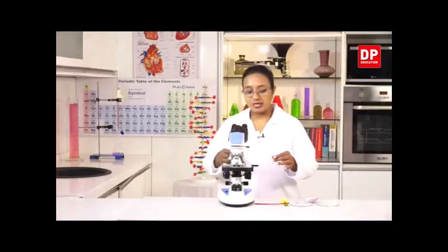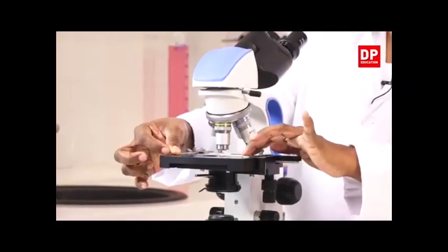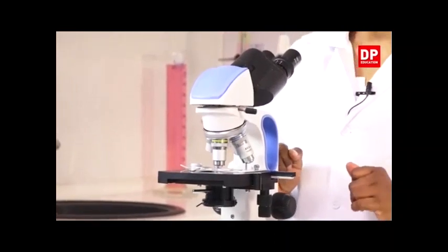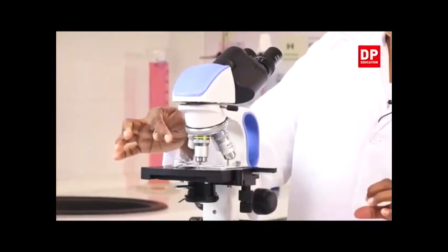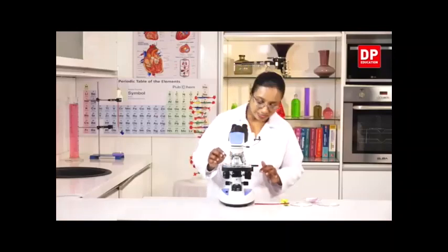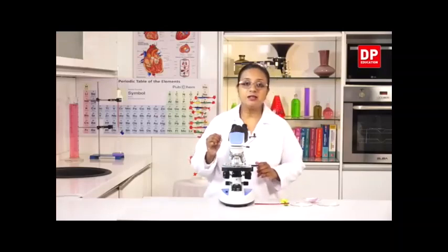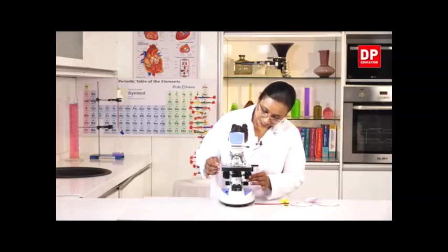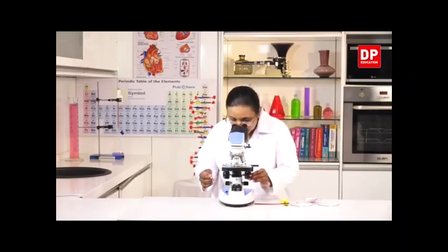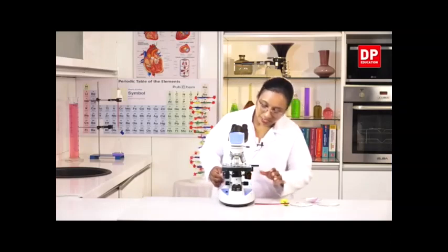Then I will have to place it on the light microscope. I have placed the sample that we prepared. Then we will have to first make sure that the specimen is in line with the lenses. To do that, I can adjust the stage and make sure that the specimen is in the correct place. By looking at it also, you can adjust it.